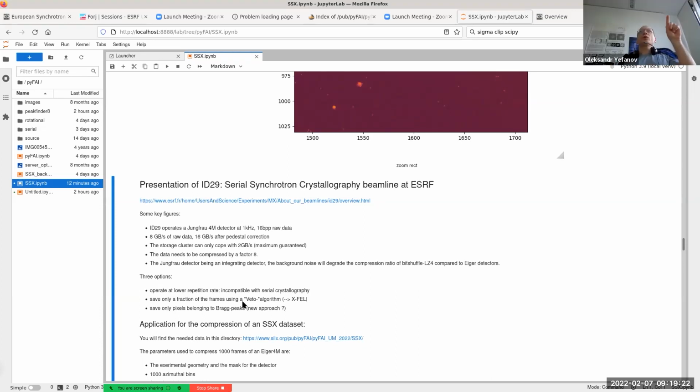Actually, may I ask one more question about this implementation? Didn't you try to consider NVMe for storage, or for intermediate storage instead of RAM? For a single module, it should be fast enough. We don't have one computer per... Okay, so you're using one.